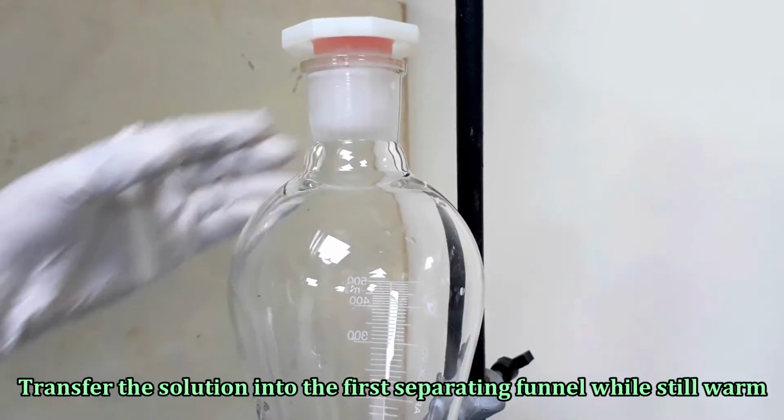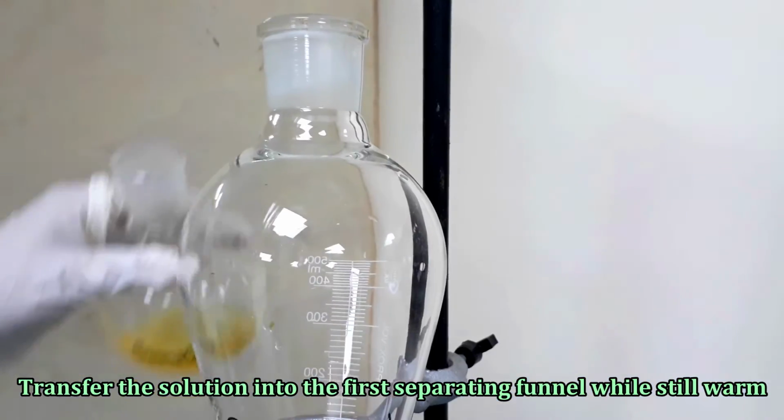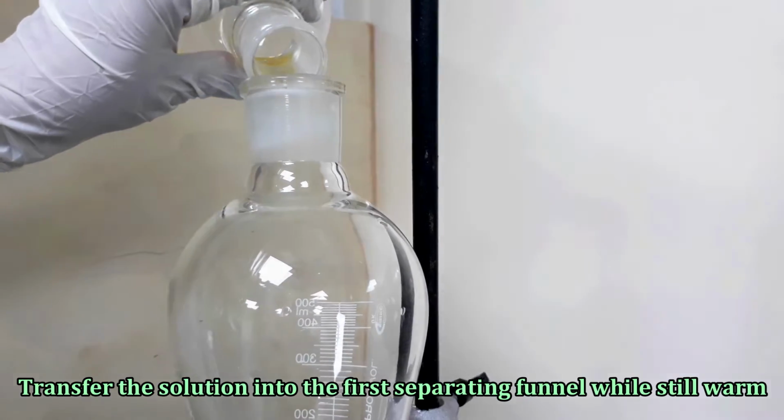After the saponification, transfer the saponified soap solution while still warm into the separating funnel 1.